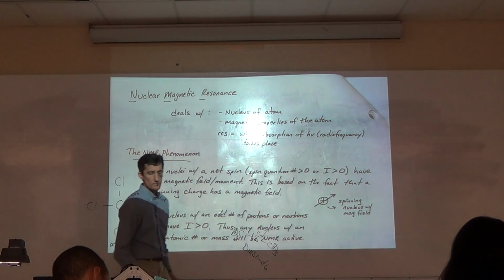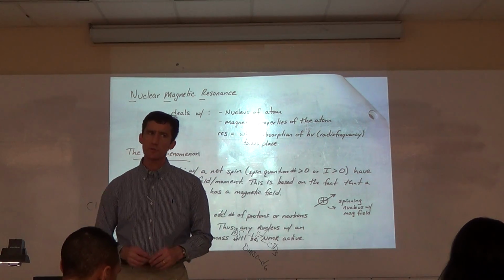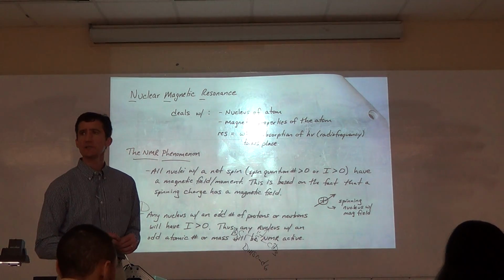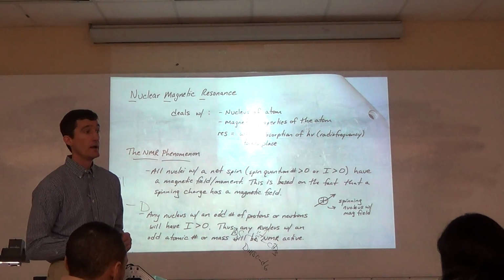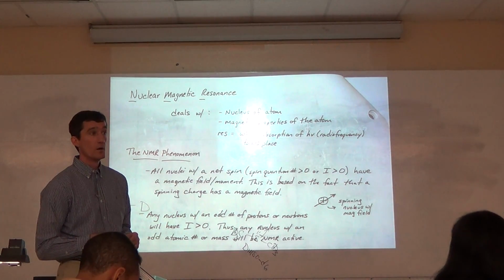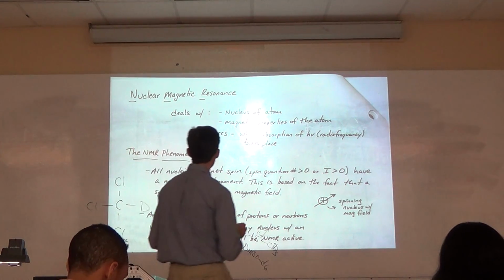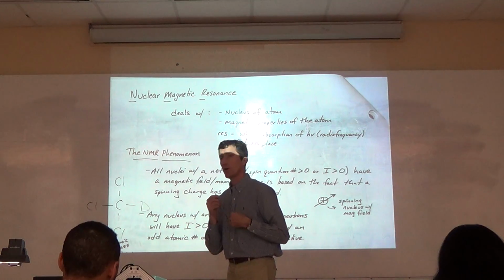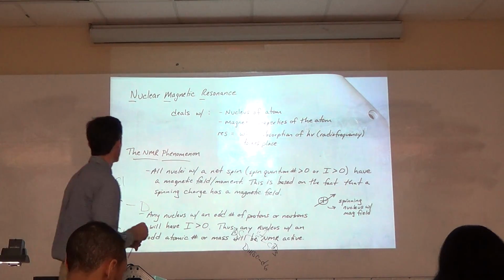That was the overview. Now what we want to get into is really what's going on with NMR and how you get signals. Why do you need the magnet? Etc. What is this downfield versus upfield thing? Can you do NMR on every type of element or what? These are some of the questions.